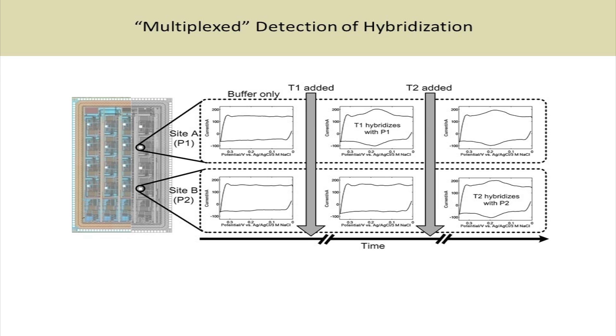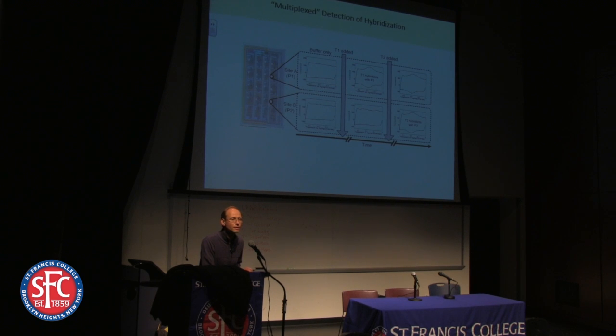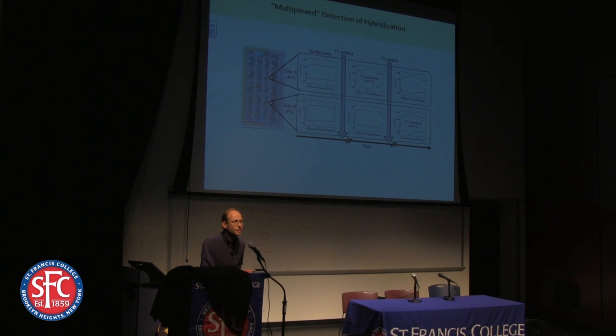Yes. This is just very basic. Everything you do on these surfaces depends on it being solvated. When I look at a chip, I think of a dry thing. But I guess you answer my question every once in a while because you talk about reservoirs and solvents and things like that. So to keep everything properly solvated for all these reactions to be happening on what looks to me like a dry surface, you do what?